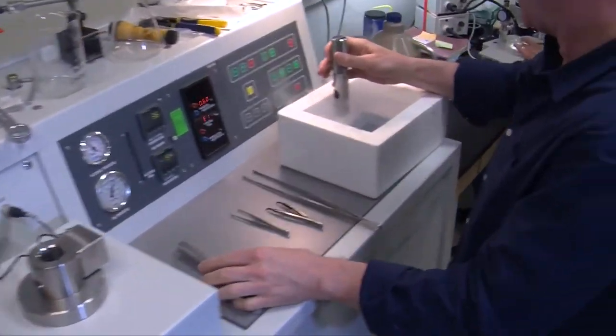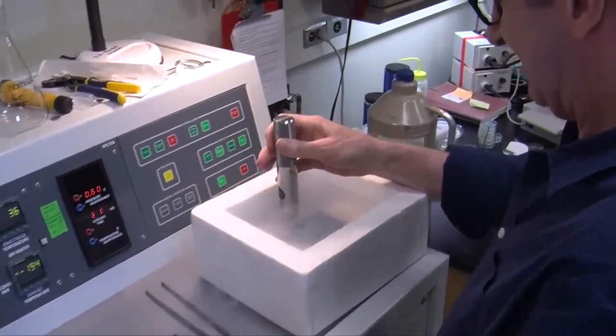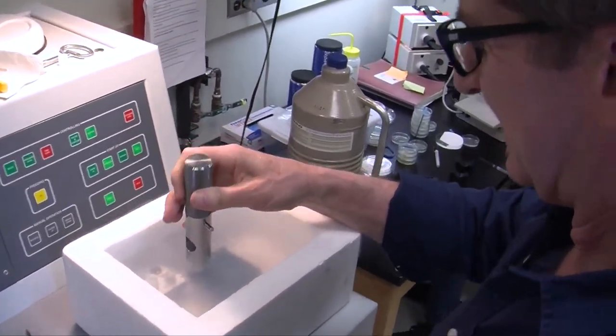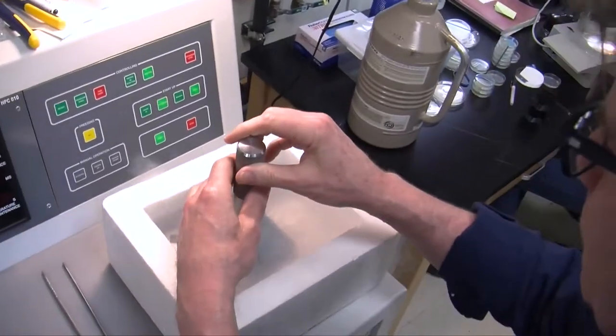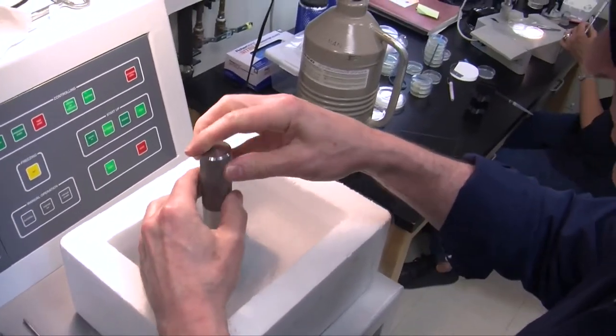And so the hydrogens that's naturally in any biological sample don't have time to rotate and align with each other as would happen with normal ice.